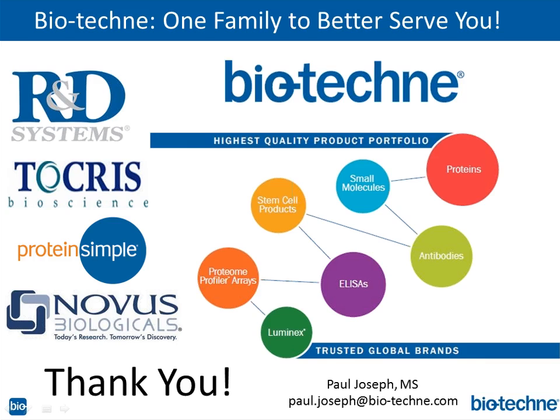But I would just say that you should check to see what the validation data is for that antibody, because it could be the antibody. Other than that, I think just messing around with the antibody, I would ask, did she try to titrate the antibody? What was the percentage of blocking agent in the antibody solution? I might even increase the amount of salt. I don't know what her salt molarity is in the antibody solution, but those are things that I would try. But dilution of that antibody, I think, is the most powerful thing to do.